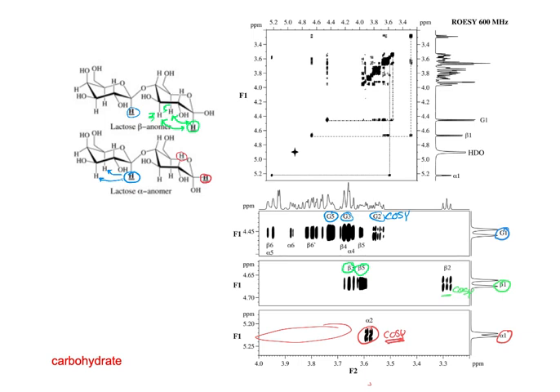Well, in each of the sugars, they always start with 1 at the anomeric position, and then they number up the chain, right? Because remember, all these sugars, if you had just monomers, would have an open chain form and the cyclic form.